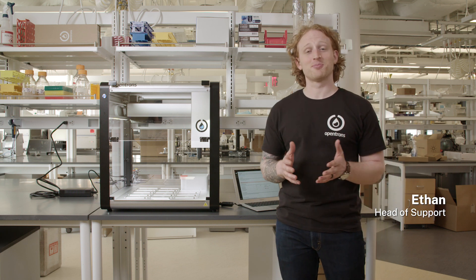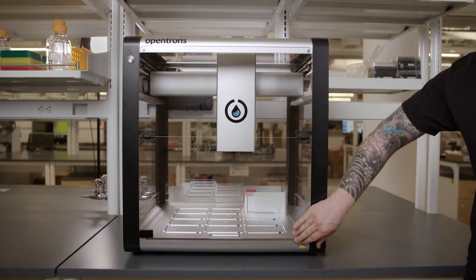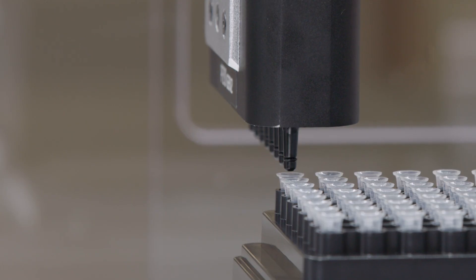Hello there, I'm Ethan, the Head of Support at Opentrons. This is the sixth video in a series we are calling From Box to Protocol. In our previous video, I completed the deck calibration, so let's get started with the tip length calibration on the OT-2.